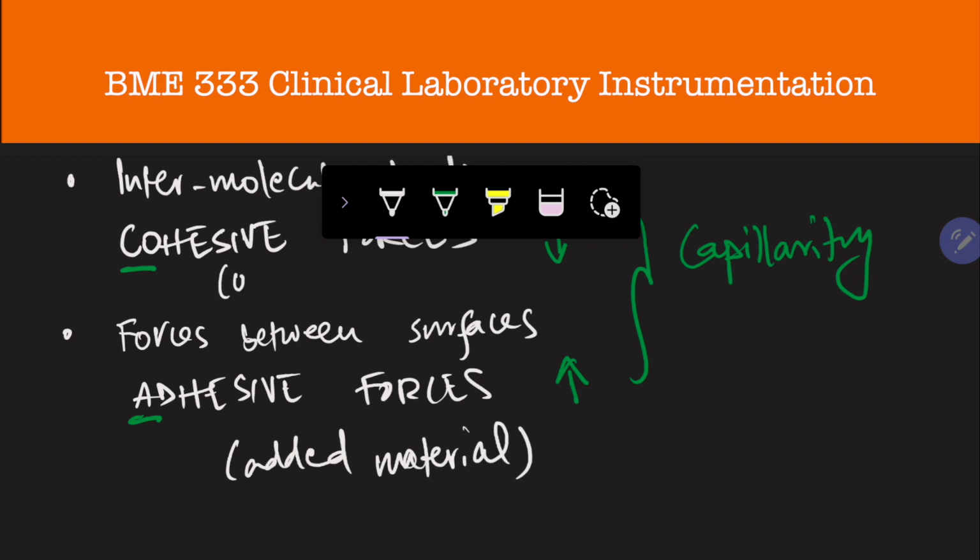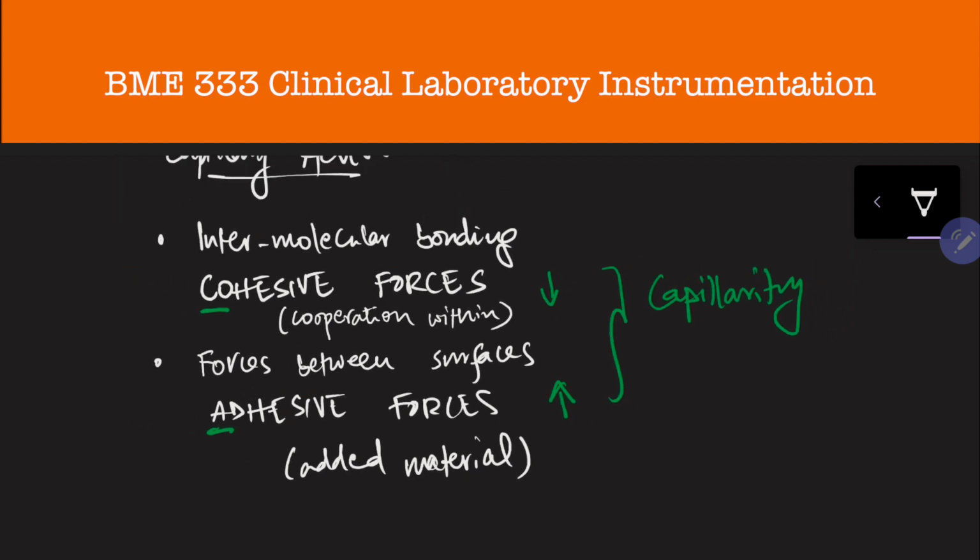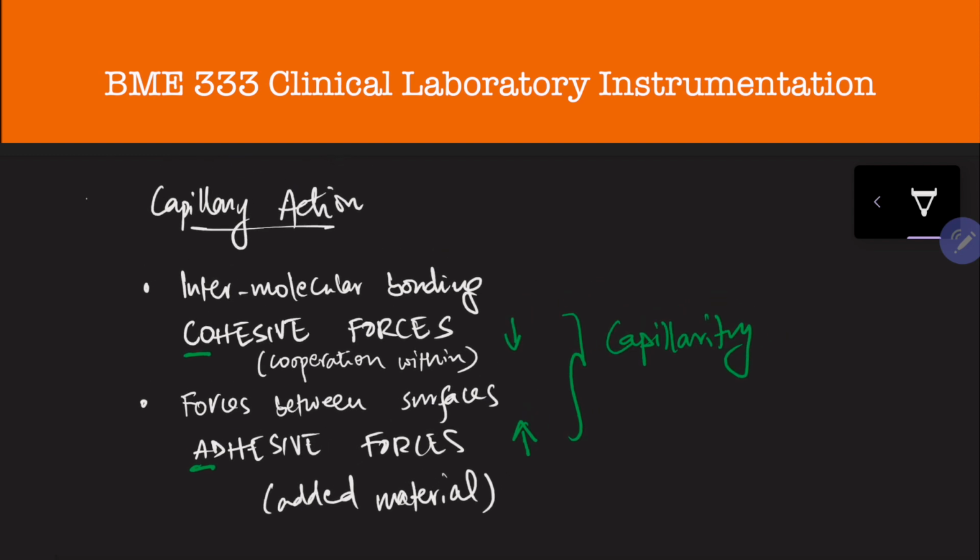So there are many different types of chromatography and the techniques associated with them, but they primarily follow a very basic or at least similar principle. There are two important things in chromatography. What's called the stationary phase is the absorbent material.